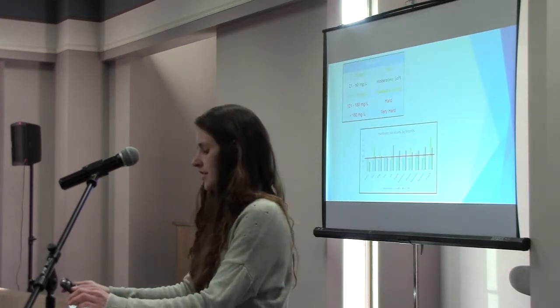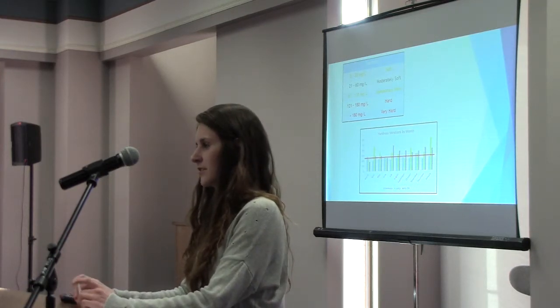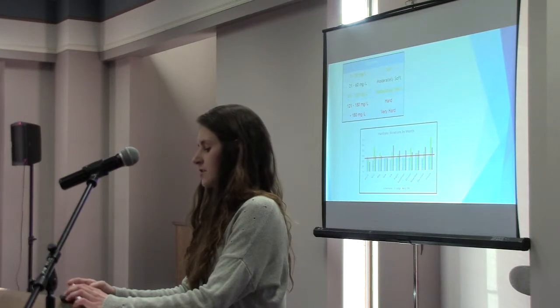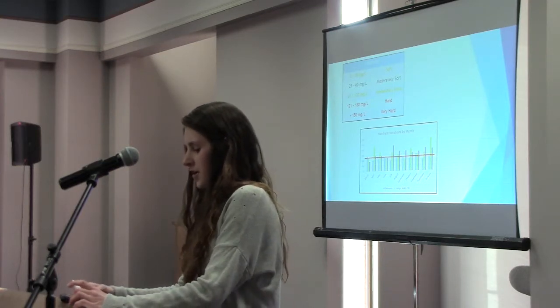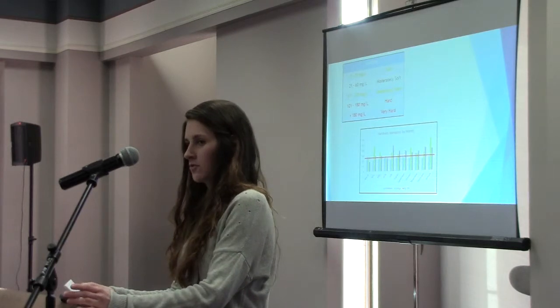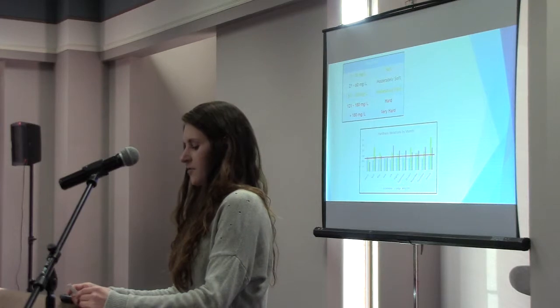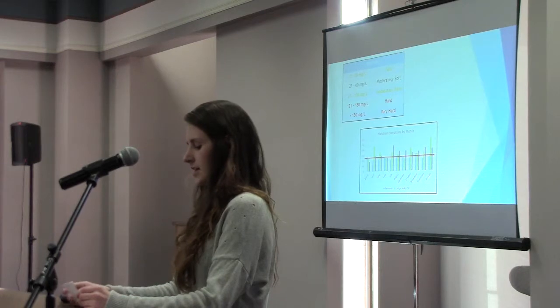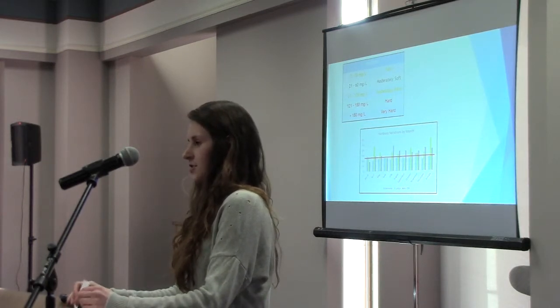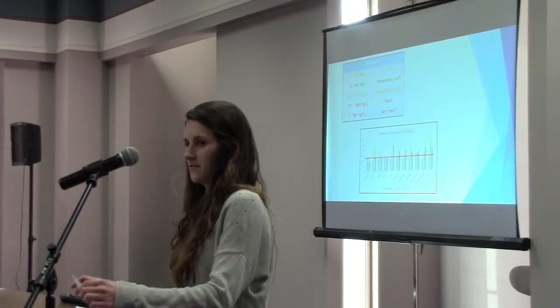Next is the hardness. Hardness is a measurement of the concentration of calcium and magnesium ions within the water. Soft water is between 0 and 60 milligrams per liter, and hard water is any amount above 60. Our data showed all three locations had relatively hard water all year, and this is not necessarily a problem, yet the multiple instances of results above 120 milligrams per liter at the Ladiga and 204 sites is concerning, because this could have potential negative effects on the fish in those locations.